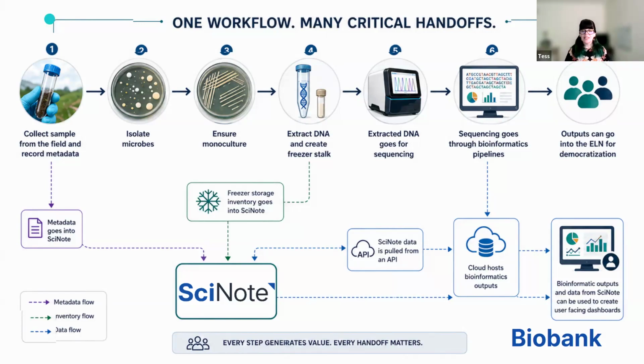So you might be collecting a sample, and that sample may be collected by a third party, by your clients. It could be collected by scientists out in the field, and you've got to collect metadata for that. And you might start running into issues about legally what the company or third party is allowed to collect on metadata. How are you going to address that? What do we do with missing data?